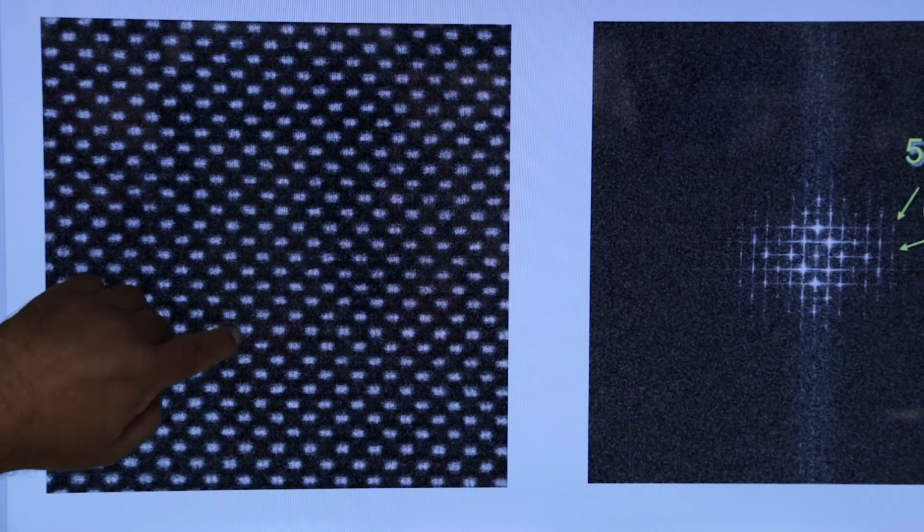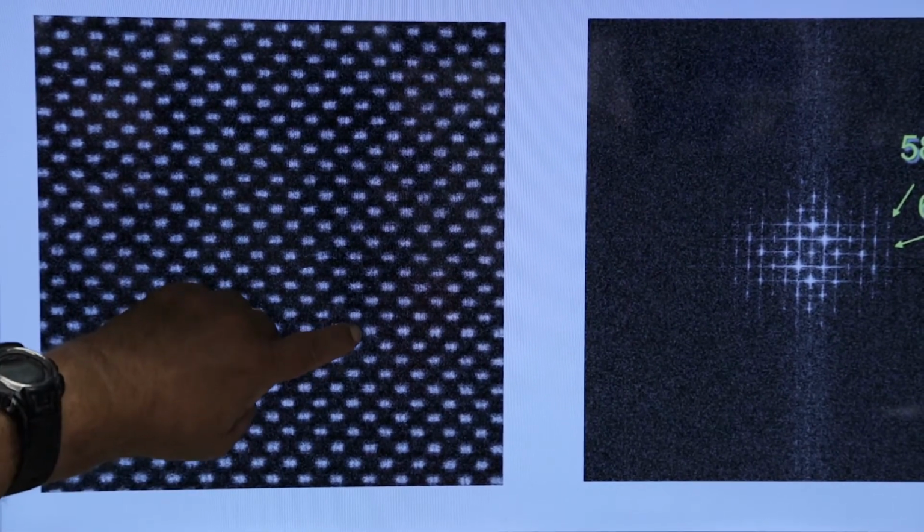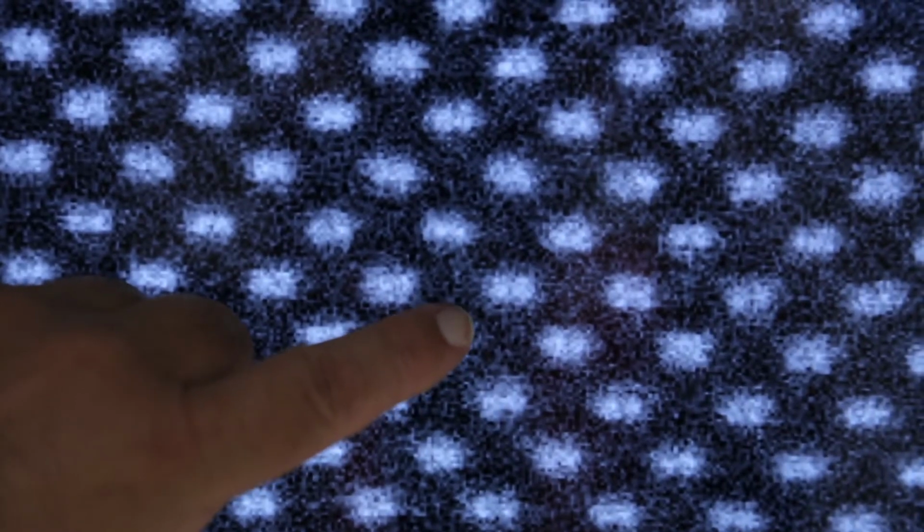So what's really fun these days is we can actually probe the atomic structure of crystals. We can actually see individual atomic columns. We can see individual atoms within those columns because some of those atoms have a higher or lower Z than the rest of the column. And so you can actually see the individual images because the electrons are scattered proportionally to how heavy the atoms are. So you can see these fuzzy little white dots on the screen that are actually atomic columns. So you can look at the crystallography directly in the images.